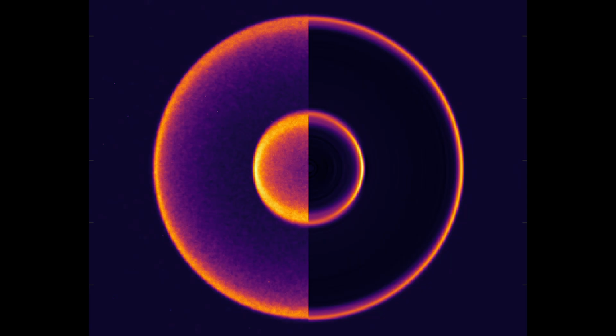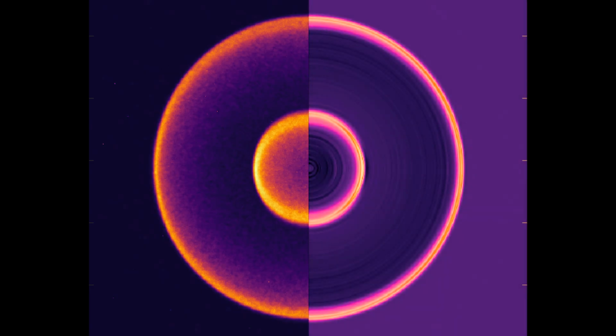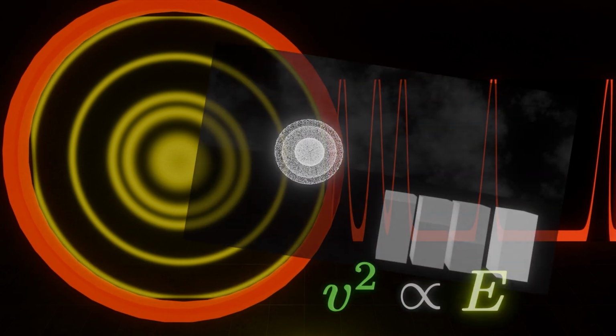So all I need to do is a bit of coding that makes this work for my data, and we get more circles? Well, okay, these circles are clearly different. What the code has done is it's guessed what the spheres would look like from our 2D image, and effectively taken a slice through that 3D sphere. And the image now has all the data we need. The intensity at any radius can be converted into the intensity at each kinetic energy, if we remember our relationship from before. And of course, we also get the angular distribution of our electron spheres in terms of the beta parameters.